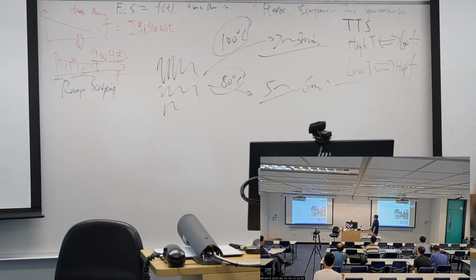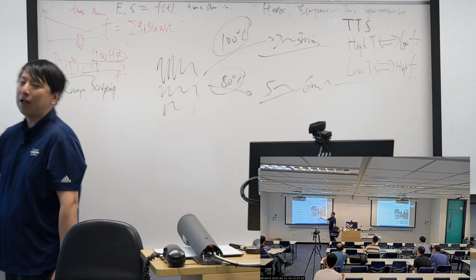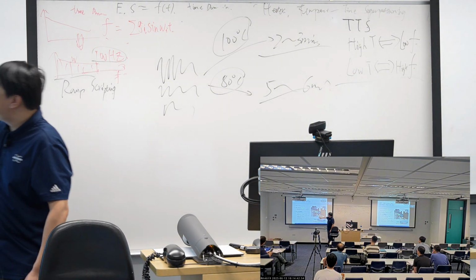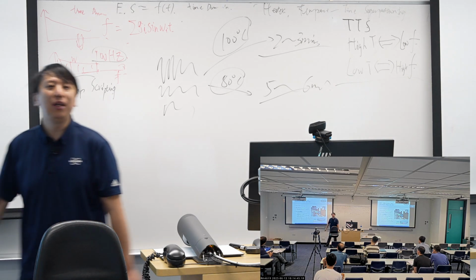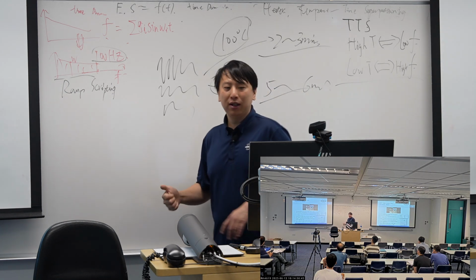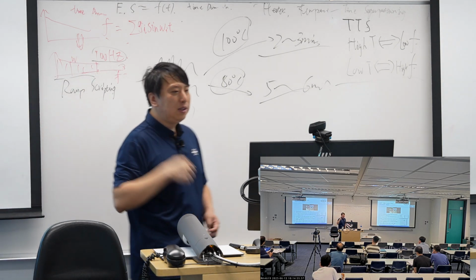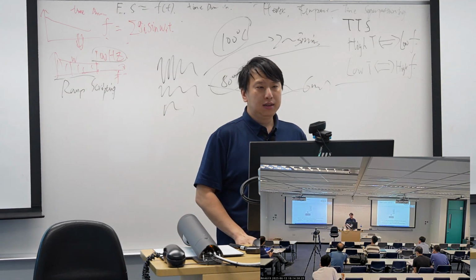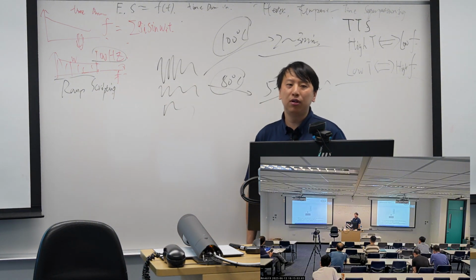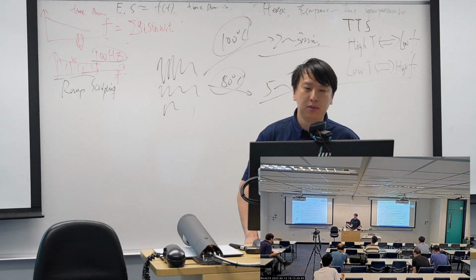So that's about our hardware. In the afternoon we can do the experiment, and we can try the heaters, we can try the actuators. Okay, so the software is very easy. We can adjust the temperatures just using the heater. And the book described several types of modulation, but the principle is about similar.